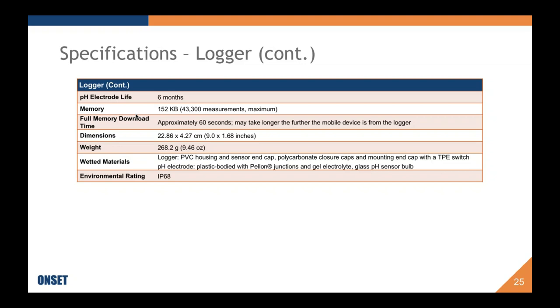So that you can clean properly the electrode, recondition it, especially if you're in fresh water. Deployments in fresh water will have a tendency to, if it's really fresh with not a lot of salts in it, dehydrate that gel layer. So it'd be good to have two electrodes to swap out between, and the calibration of the second electrode should mitigate any concerns about differences in data.